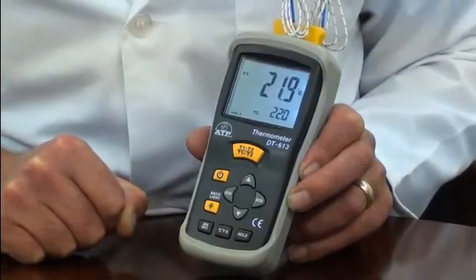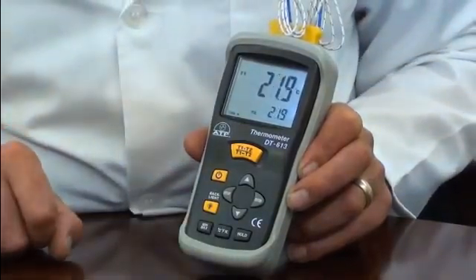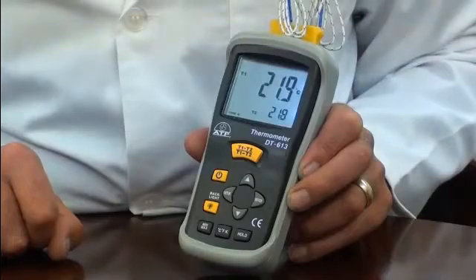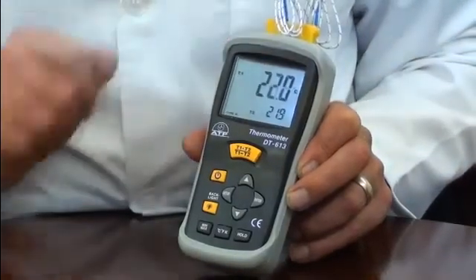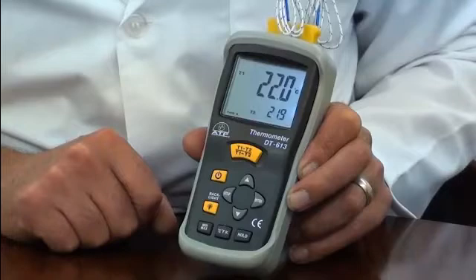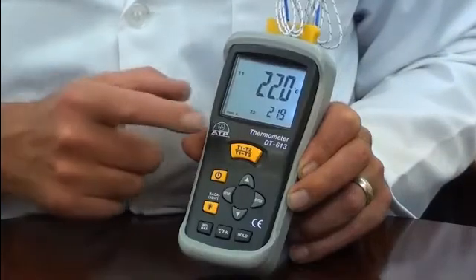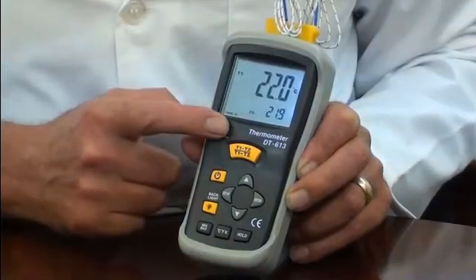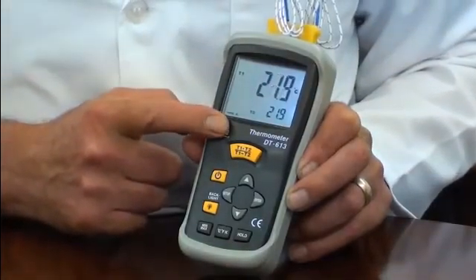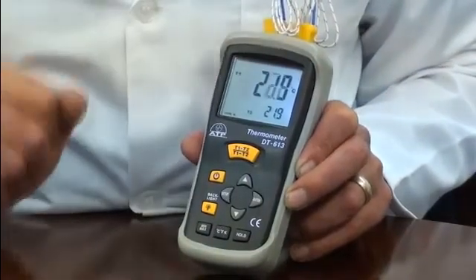The user can select readings to be displayed in degrees C, degrees F, or Kelvin. Having two probe inputs, the thermometer can be used to measure two different temperature sources, with easy selection of individual measurements or differential. Differential displays the difference in temperature of probe 1 temperature minus probe 2 temperature.